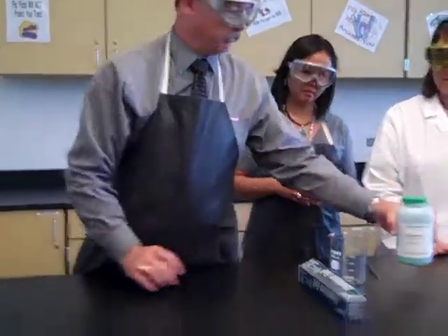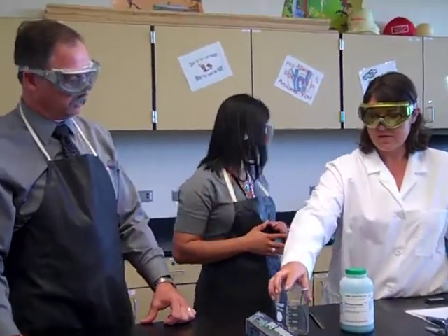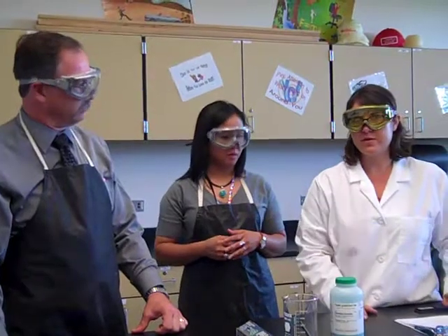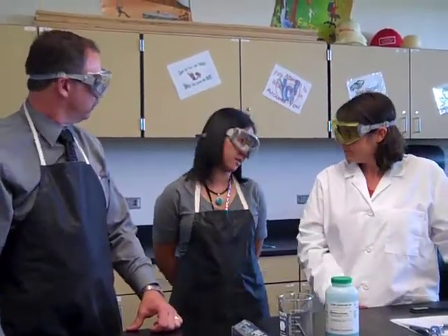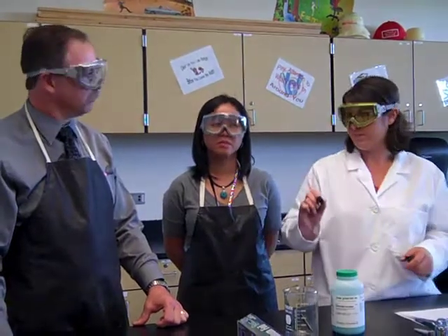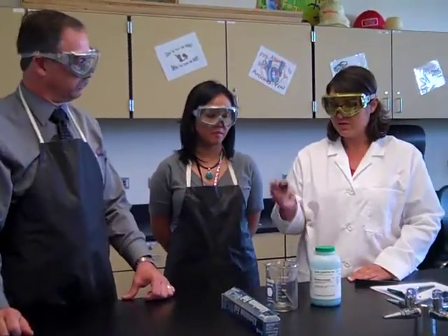Once we get the copper chloride into the beaker, we're going to make observations of the powder all by itself. The whole point of this lab is to observe a chemical change, so we have to see what it looks like before we do anything — and what it turns into after. We're also going to take the temperature of the solution before we put the aluminum foil in, because the foil is going to react with the copper chloride.